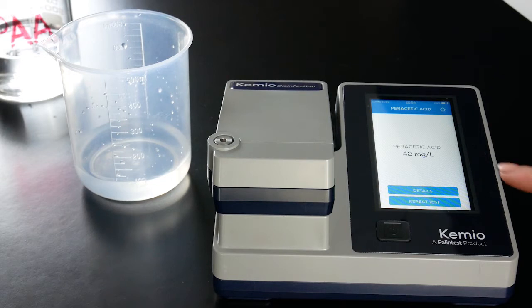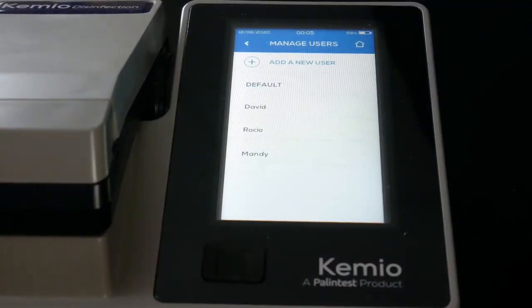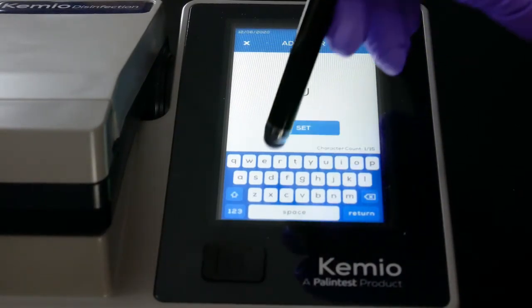You can add notes or scan references after your test. Did you know, Kemio works with both gloves and a stylus?